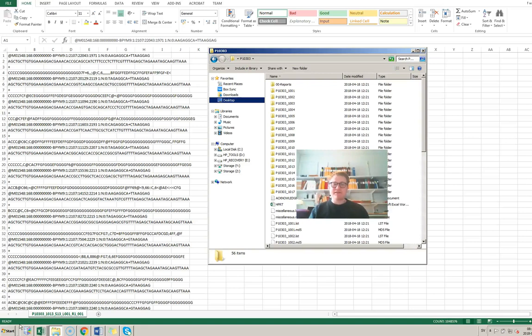Hi everyone, this is Fredrik Vermling again. In this video I'm going to show you a little bit how you can look at next-generation sequencing data from your CRISPR screen. I want to emphasize that this is not the way you should analyze this type of data — there are much better ways — but it could be a quick way just using Excel to have a look and get some feeling for the results.